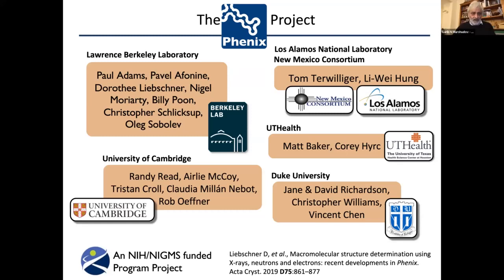Thank you. I'll read Andrea's question also, and at the same time, I will move this question to Slack so that you can answer those questions. So Andrea asks, as the field moves to use AlphaFold models as starting points for structure solution, geometric validation may no longer be as useful, and density maps are not always corresponding well enough to models to be useful for validation alone. What's your take on that?